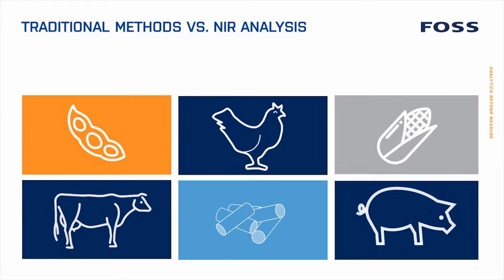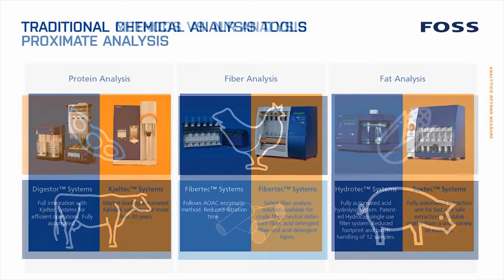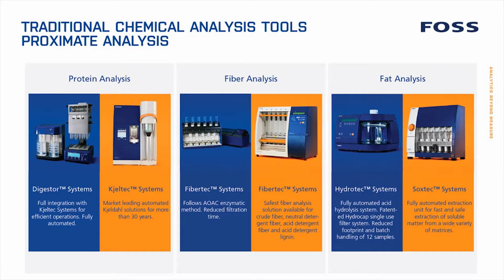To fully appreciate the power of NIR for feed analysis, it may be helpful to discuss and then compare NIR to the contemporary methods otherwise used to analyze proximates in feed and feed ingredients. Traditionally, feed analysis was performed with what could be called wet chemical analysis methods.